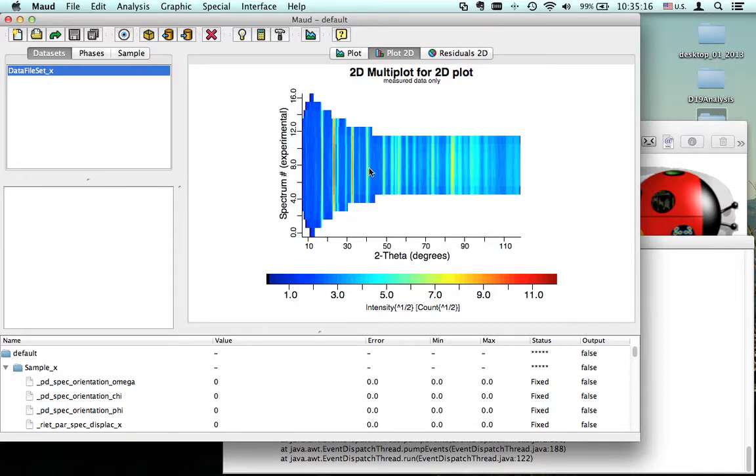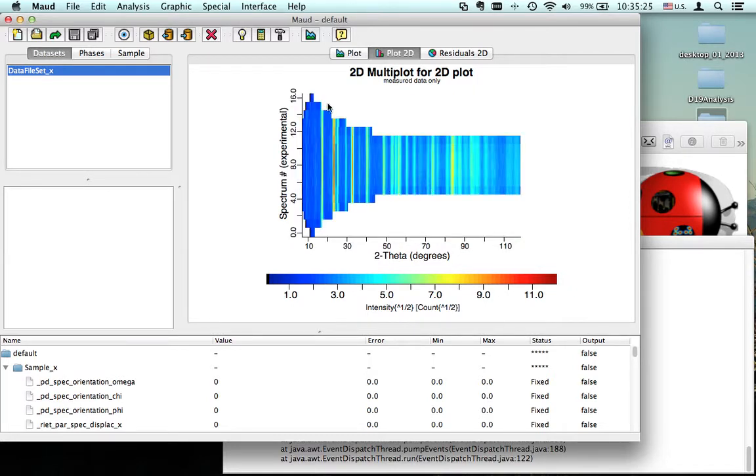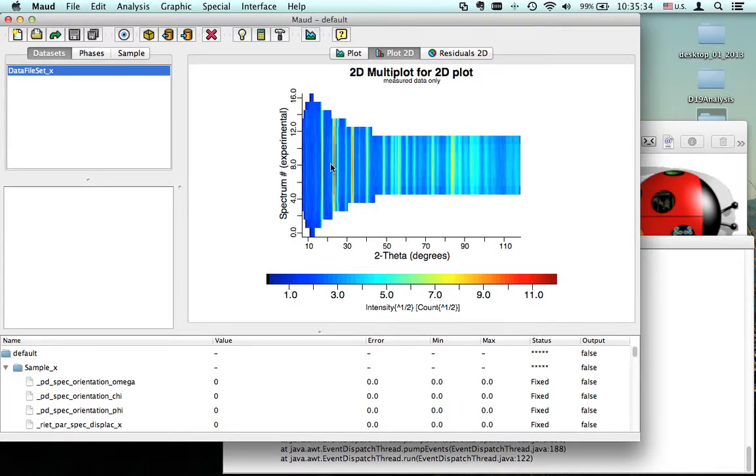Control click to zoom back. Here instead the line should be better, a little bit much better over here. This one also didn't have any artifact on it. In fact, it's quite straight. This is because I was giving X and Y already sufficiently well calibrated. Don't worry if you get a little bit not very good, you can refine the centering later. Okay, so now this is okay.